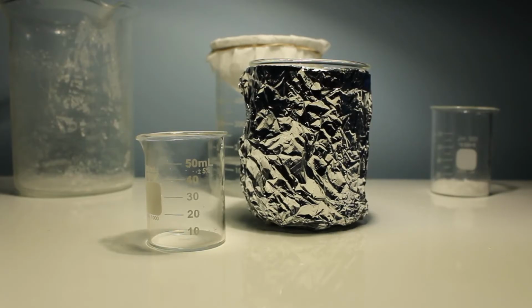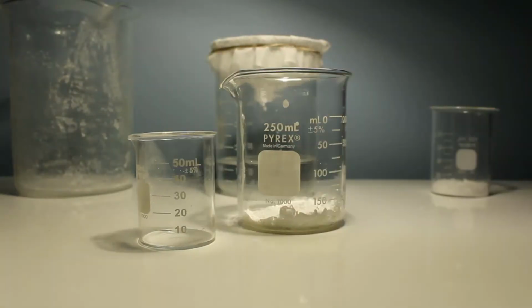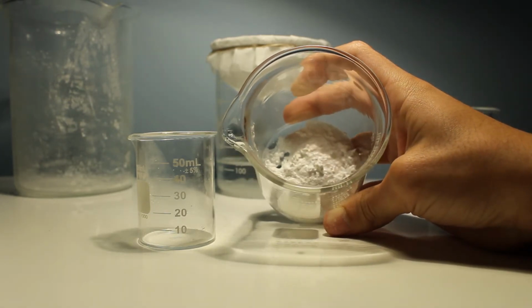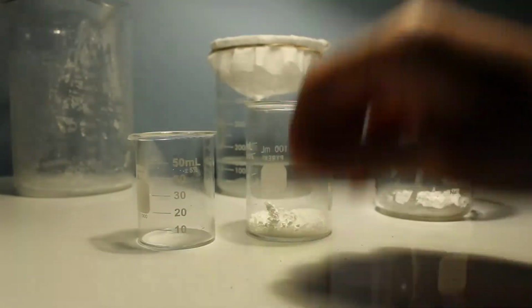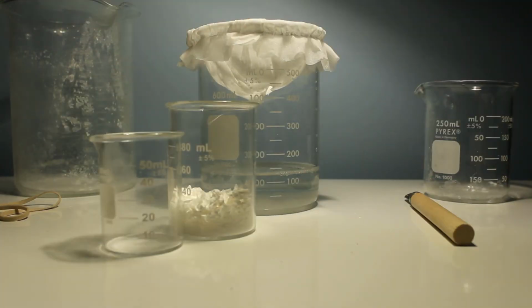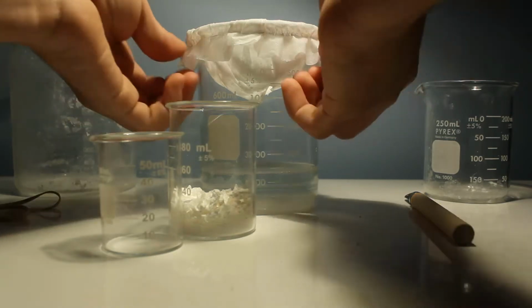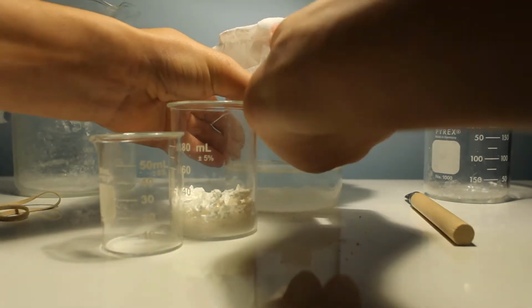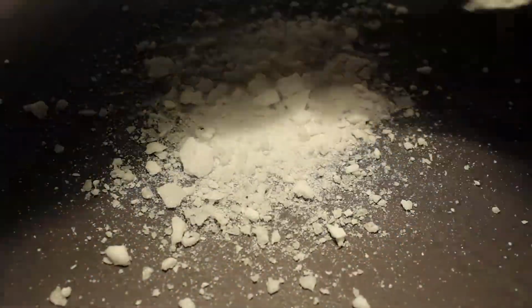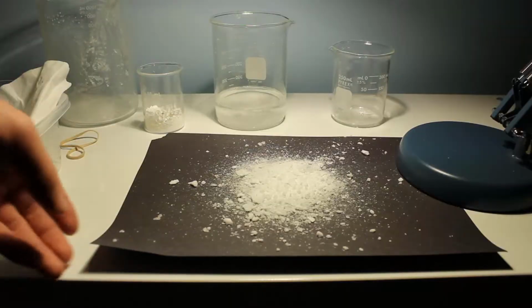The salts are dried now, and now we can remove the aluminum foil and see what mass has been formed in the beaker. The mass that formed is very strange. It's one solid piece, and yet it looks like it'd be fine like sand and fall apart easily. Well, I have the coffee filter remaining, still covered in crystals, but it's a bit stuck. Well, now we have this thing filled with crystals, and I'm gonna try to get some of the crystals. So let's remove the lamp.